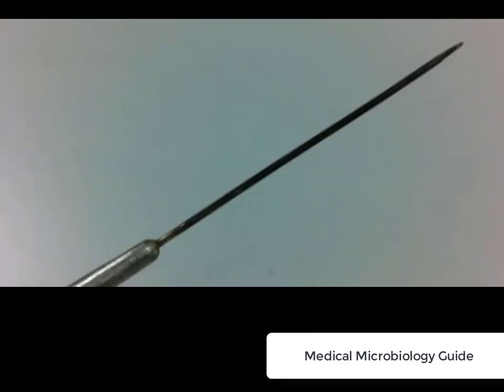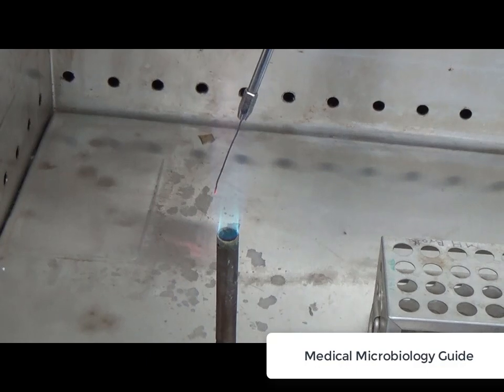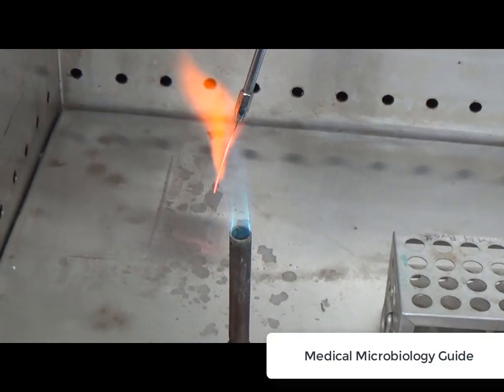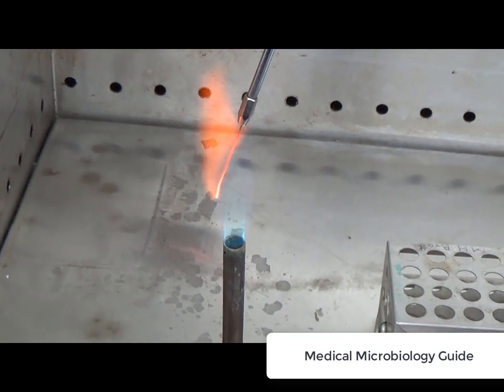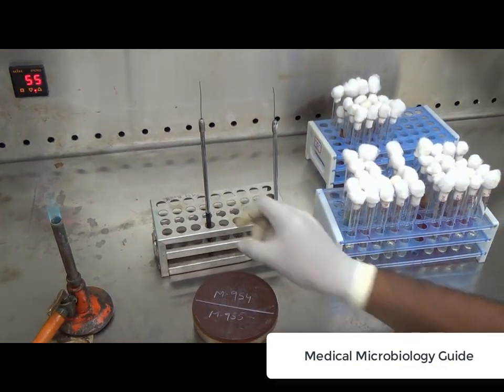The inoculating needle should be sterile before using and also sterilized after use. It is sterilized by holding the needle in the blue flame of a Bunsen burner. The needle should be flamed at a downward angle through the flame in the inner core until it is red hot. The downward angle minimizes the microbial aerosols which are created during heating. It should be cooled for 10 seconds before use.